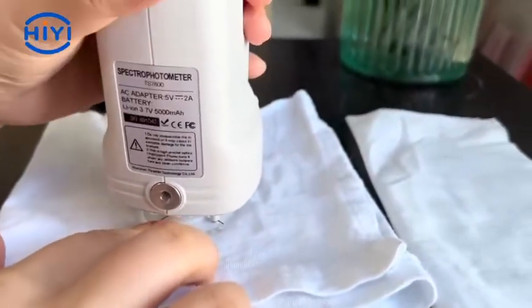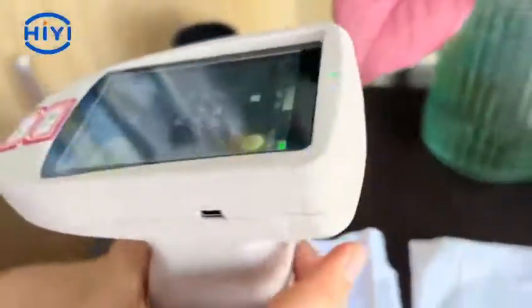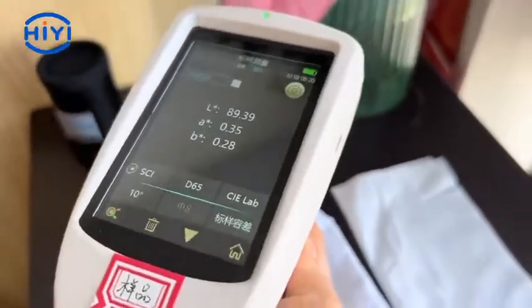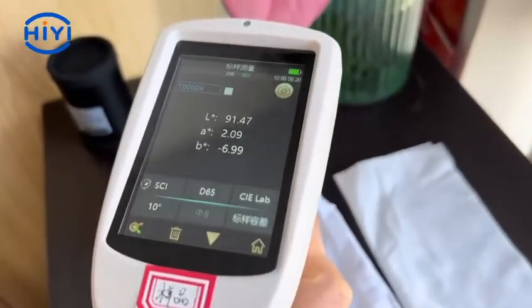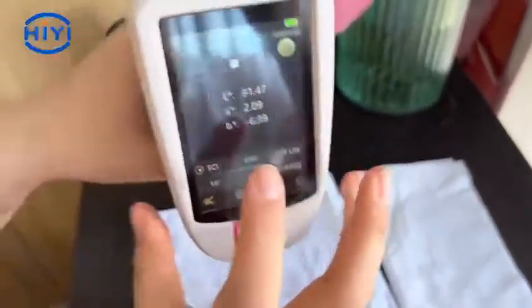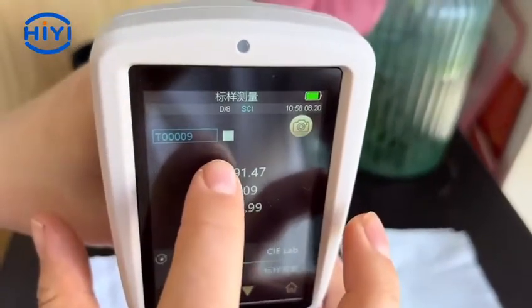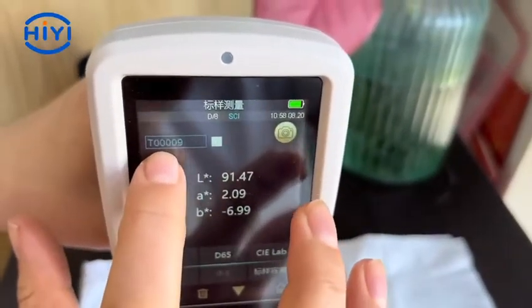Put the spectrophotometer on the fabric and press the black button. Ok, we got the value. Here we can see the white is our tested fabric color, and this is the number.